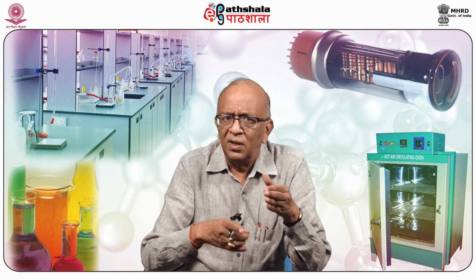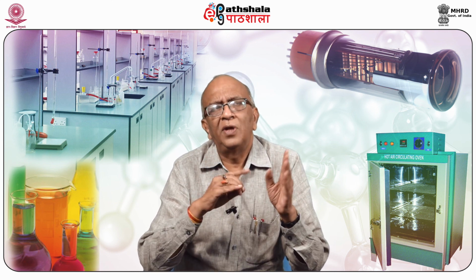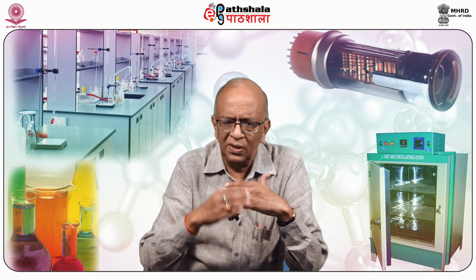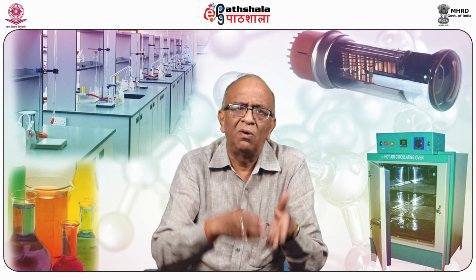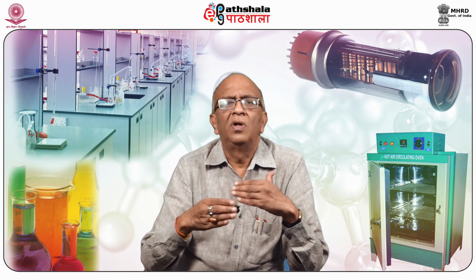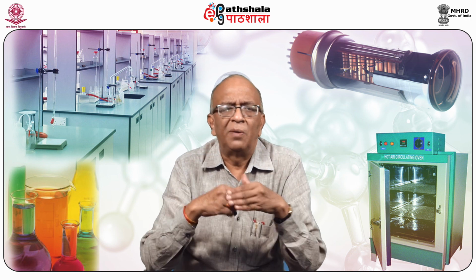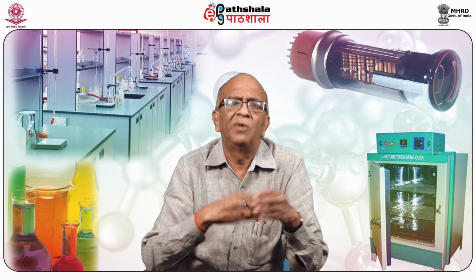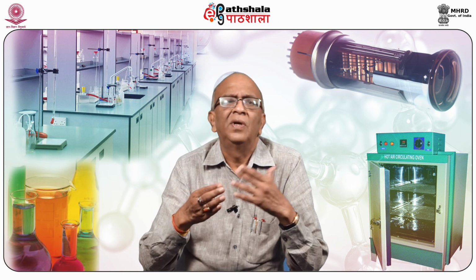What is the stationary phase here? The stationary phase is not silica gel, but the water vapors held on the silica gel. And the mobile phase is also a liquid which you have taken in the system. It may be a single mobile phase or a combination of different solvents.